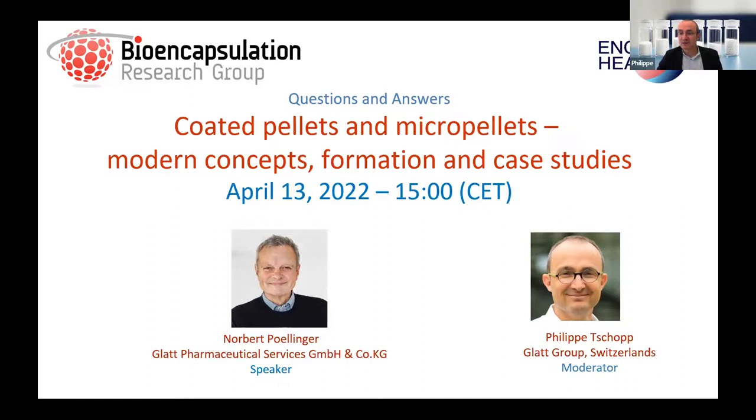Okay, so Frederick Ekman has a question. For the MicroPX, do you see it as an alternative to spray drying to make amorphous solid dispersions? Very nice question. Yeah, very good question, Frederick. Good not to hear you, but to hear your question.